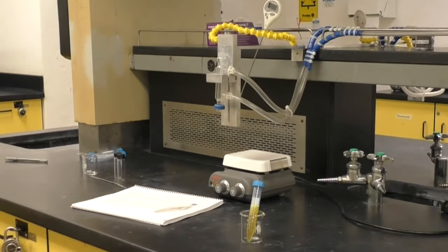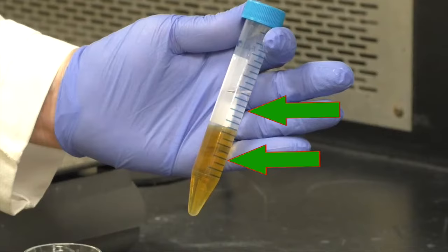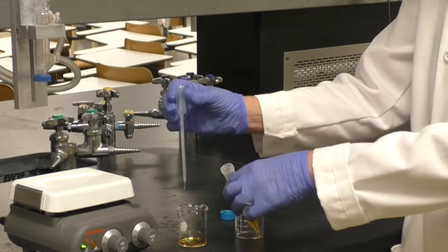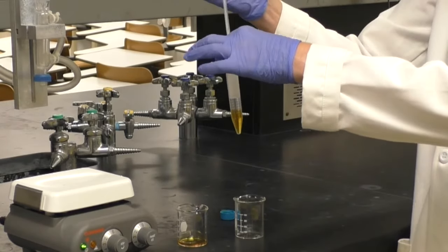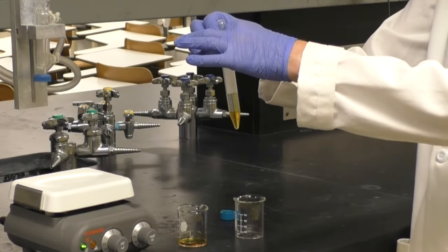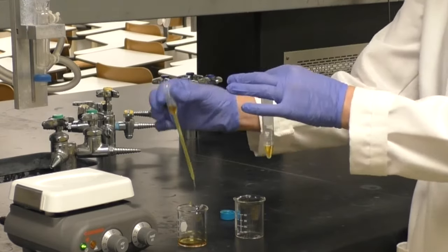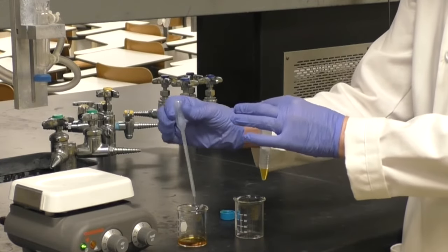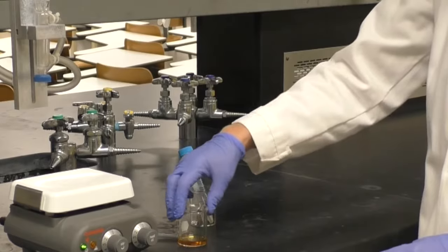Place the centrifuge tube in a beaker and allow the layers to separate. Use a transfer pipette to carefully remove the lower aqueous layer which contains the conjugate base of the eugenol. Transfer this liquid to a 50 mL beaker.